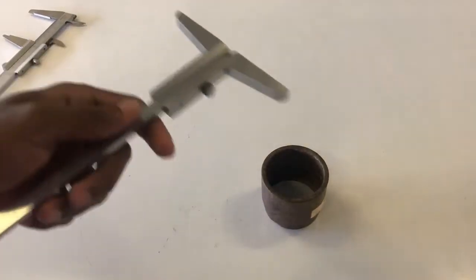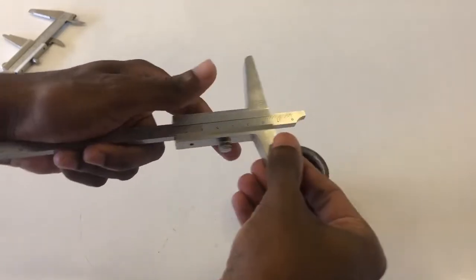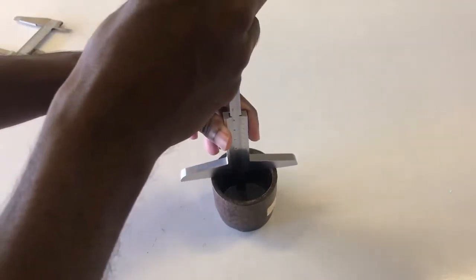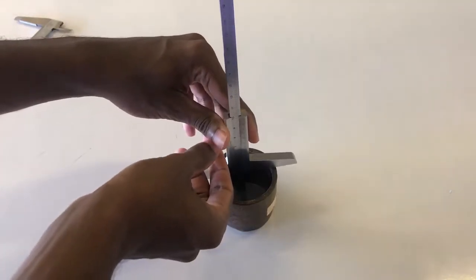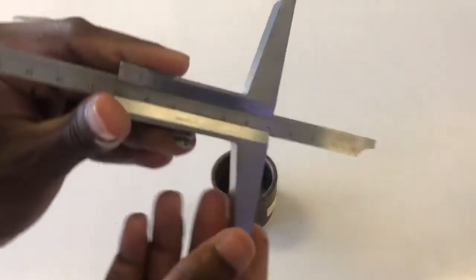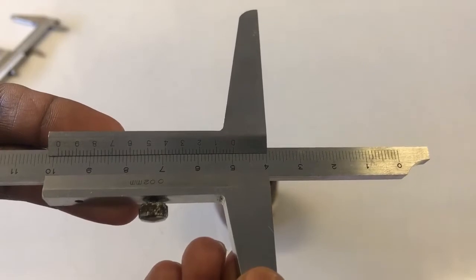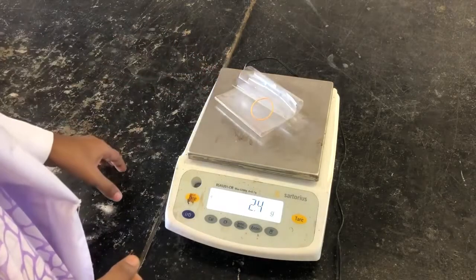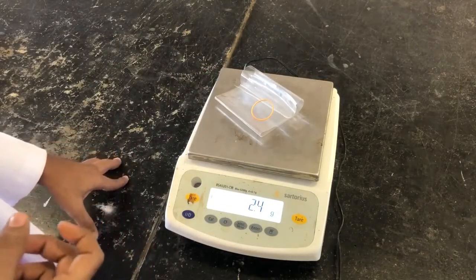Similarly, we have to measure the height using depth vernier caliper. Screw out. Now the depth probe is movable. Keep the caliper into core sampler and penetrate the probe as much as possible. Once it is done, screw it. Take the caliper outside and note the reading. The zero coincides with 5, so it is 5 cm in height. Then we will measure the weight of empty polythene bag and rubber band which we are going to use to take the soil sample from the field.